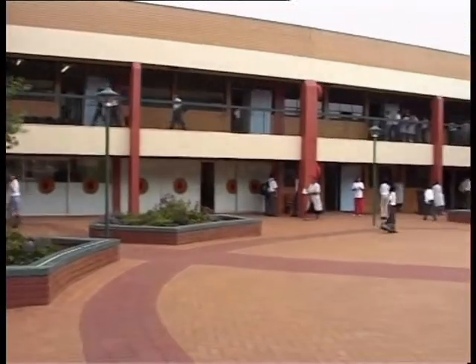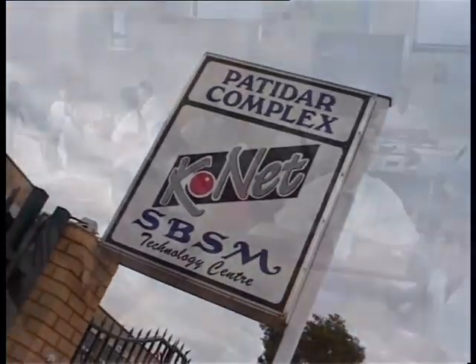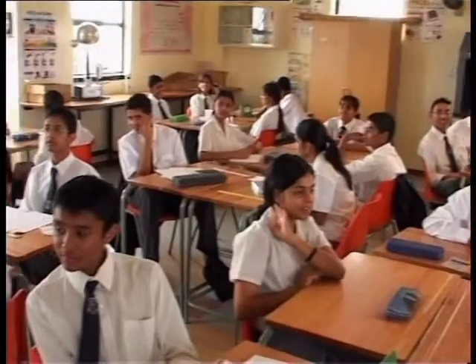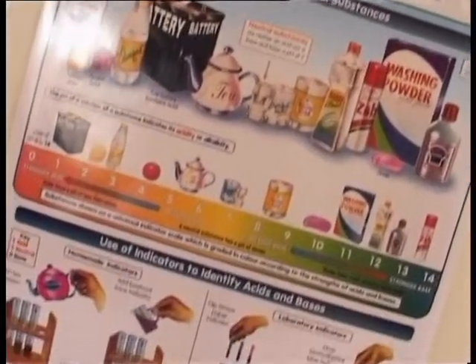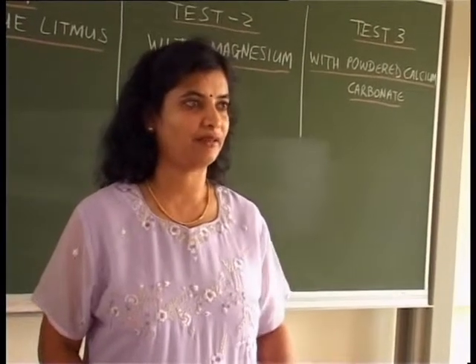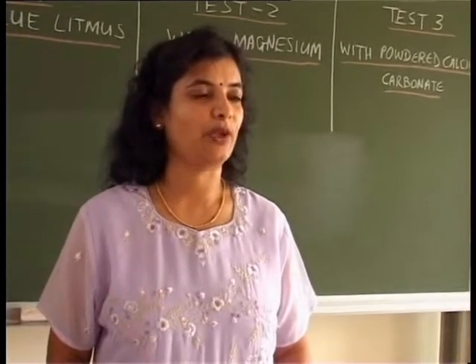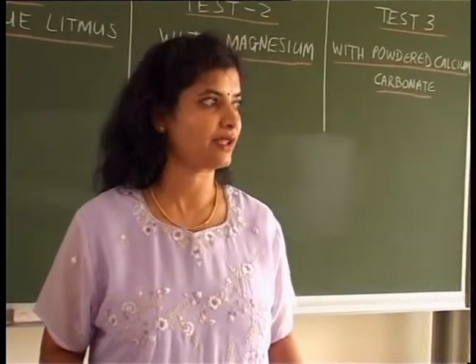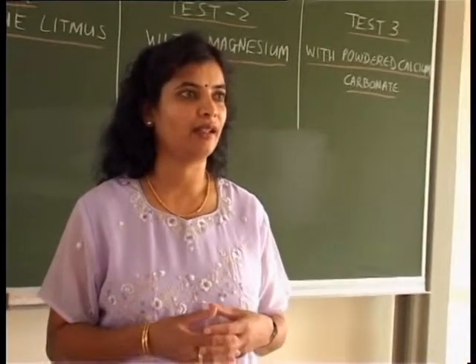Classroom management is an important part of all science lessons. At SBSM Independent School in Lenasia, the teacher, Dr. Curti Beecher, is beginning a lesson on acids and bases with a grade 10 class. Right, today we're going to do 3 different chemical tests on 5 different substances. Now we don't know what the 5 different substances are, so you should handle all these chemicals with care.